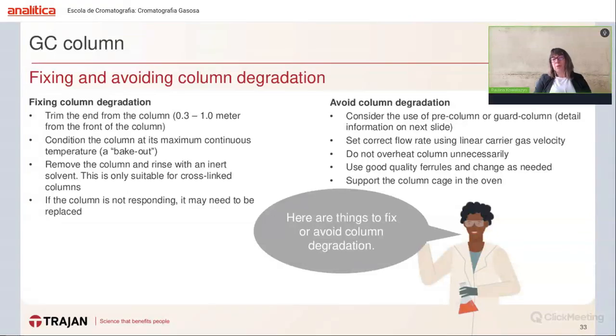I will start with avoiding the problems, as this is always the best route, to avoid the problems before they arise. If we consider the use of a pre-column or guard column, we will be able to spot the issues earlier, so our column will not be damaged. We should check and correct the flow rate of the gas in our analysis.